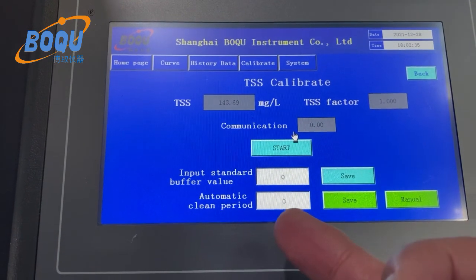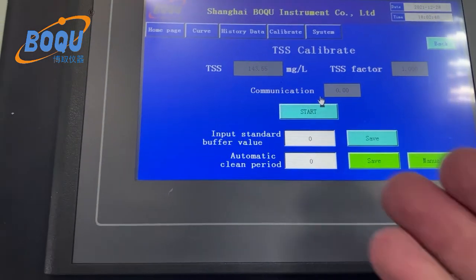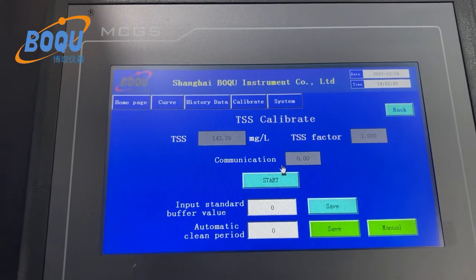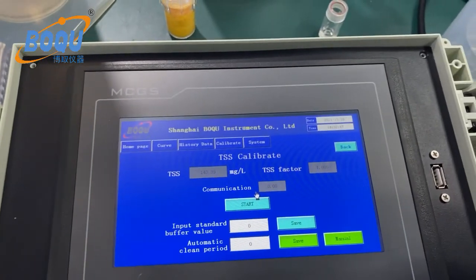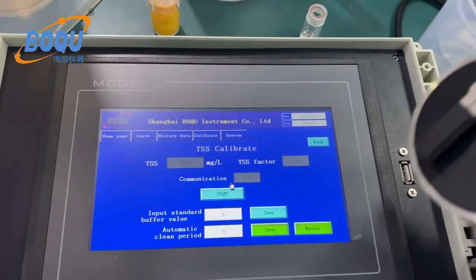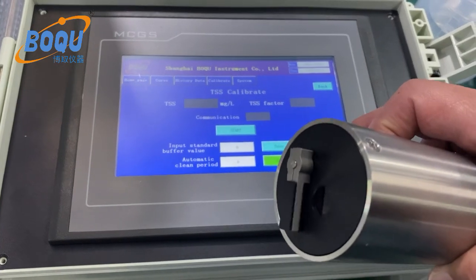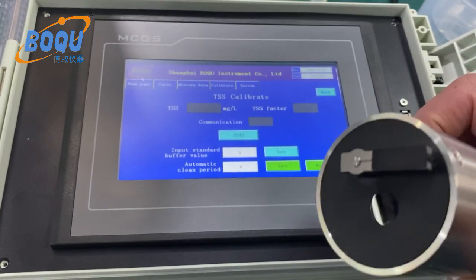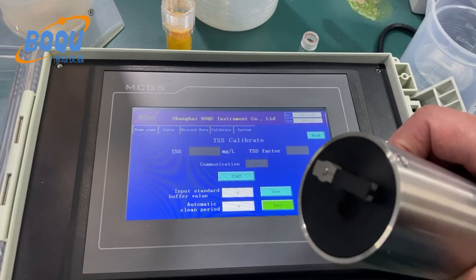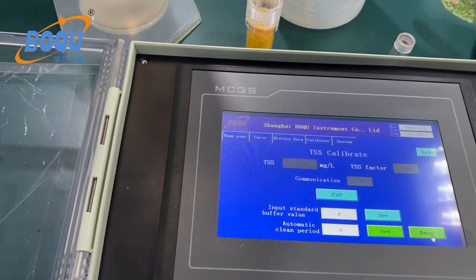You can set the auto-clean period — the unit is minutes. There is also a manual cleaning option. If you click manual, the wiper will start working. We can test it manually — you can see the wiper in action.